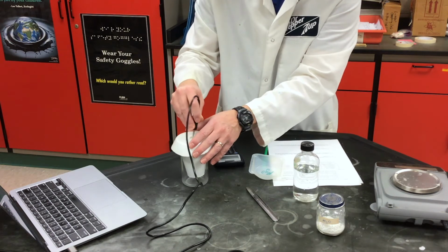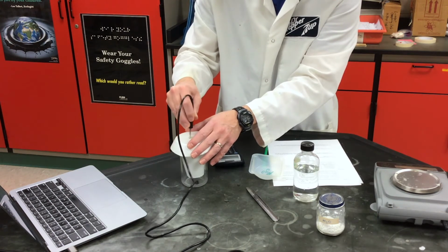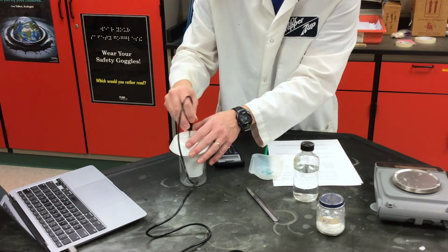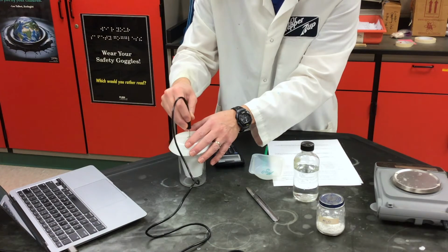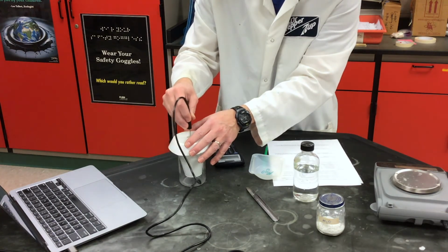I'm at 22.0. The goal here is to hit that highest temperature, 22.1, 22.2, 22.3, 22.4. We're going to keep going until the temperature doesn't go up anymore. I'm at 22.5.